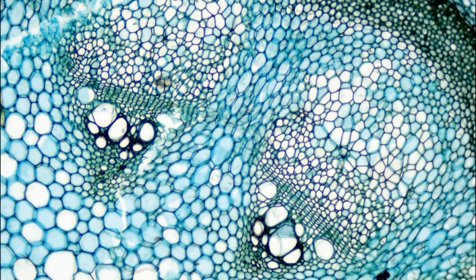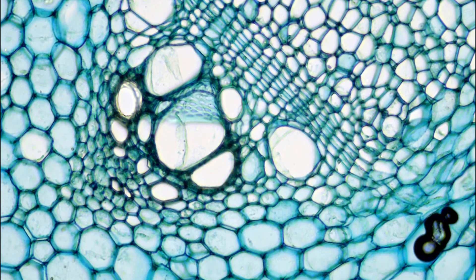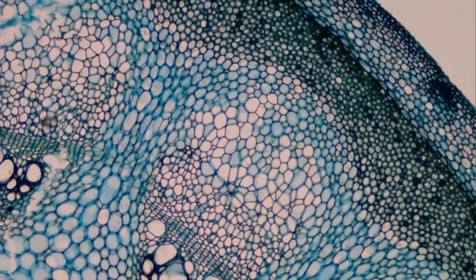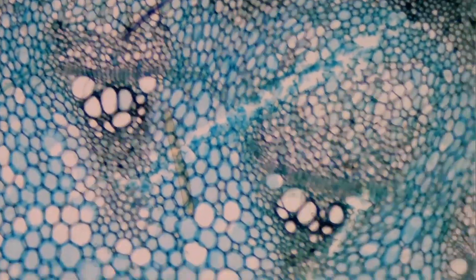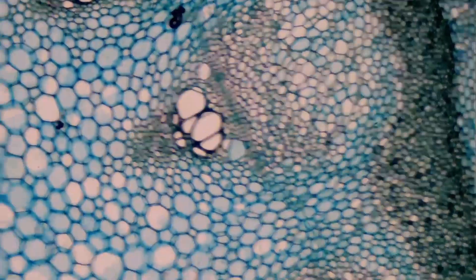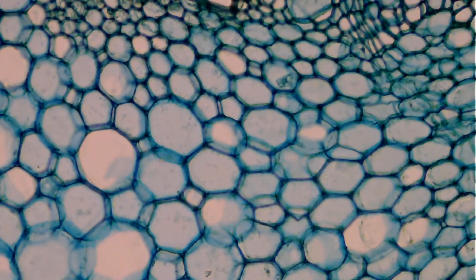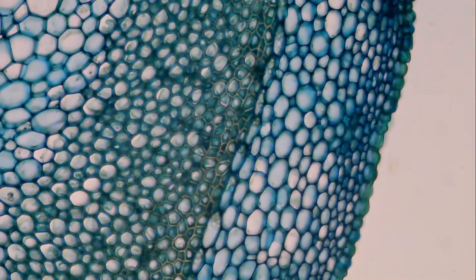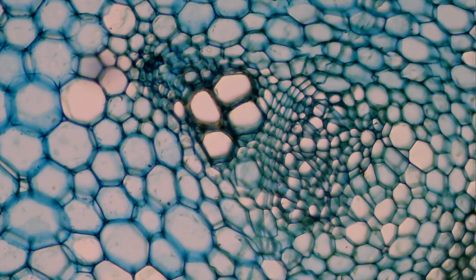This is now a picture that I have taken using the four times magnifying objective, the ten times magnifying objective, and here this is now the forty times magnifying objective. It looks a little bit noisy and that is camera noise because it was already quite dim. This is now a video that I made where I'm simply looking at the slide. These are all cells that you see here. Let's go up with the magnification a little bit. These are the individual cell walls that you see of the plant cell cross section. Those larger cells that are bundled together, that's the so-called vascular tissue where water is transported.